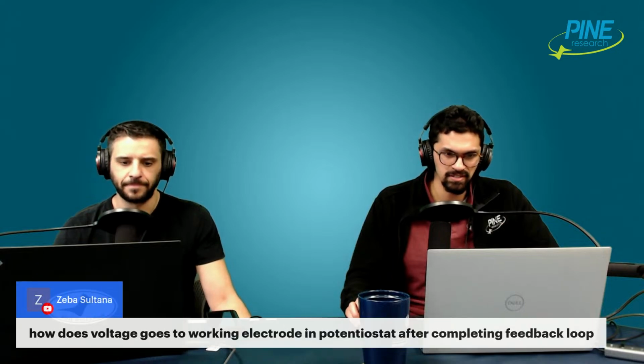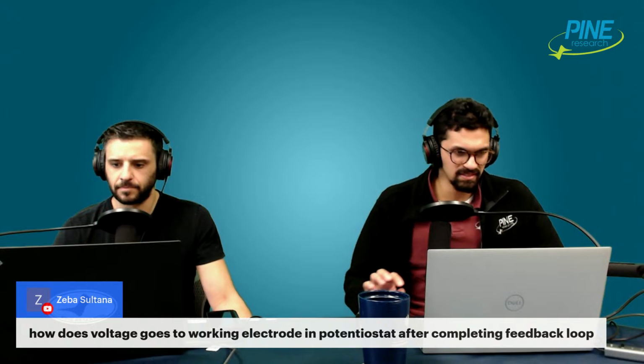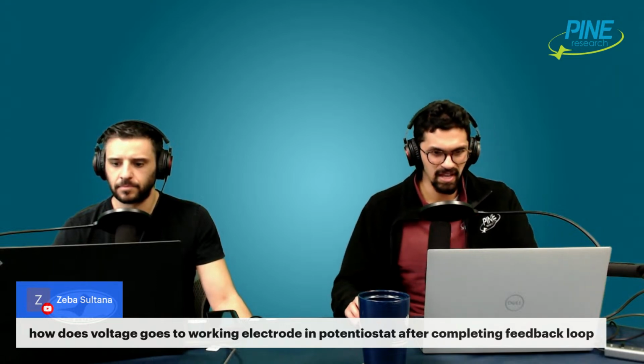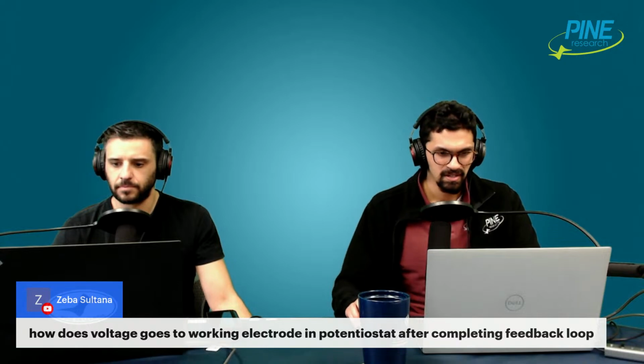So Zabah has a question. He wants to know how, in the potentiostat, the voltage goes into the working electrode, and more specifically, how the voltage goes into the working electrode in the potentiostat after completing the feedback loop? So we'll go over this very quickly.